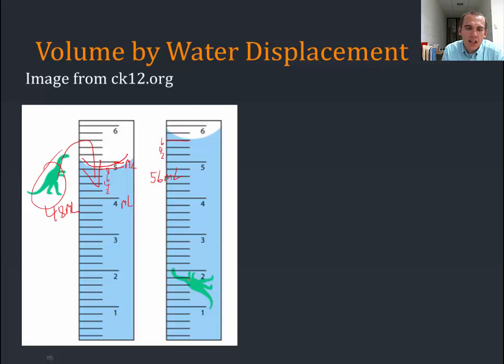So if I want to know the volume of the dinosaur, I can tell you the water ended at 5.6 milliliters, and it started at 4.8 milliliters, and the difference between those things is 0.8 milliliters. That extra 0.8 milliliters of displacement of water came from what was displaced by that dinosaur. So we call this the water displacement method because this thing displaced that much water, so that's how much volume it has.